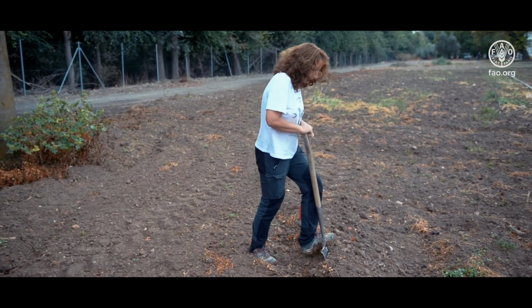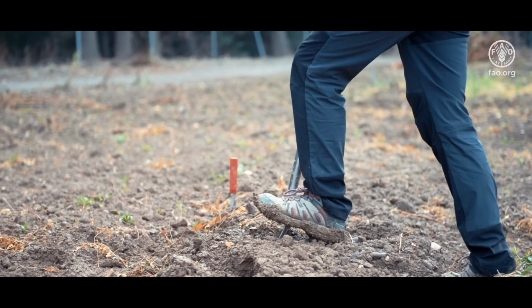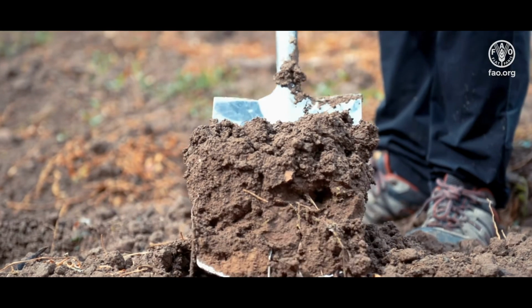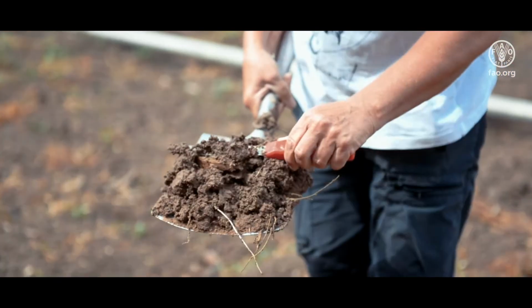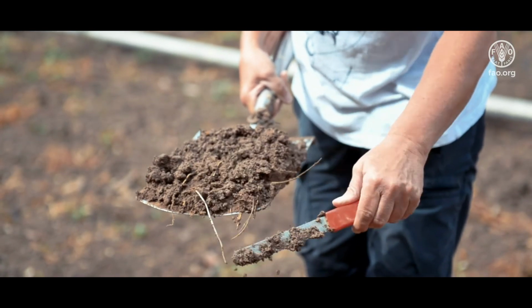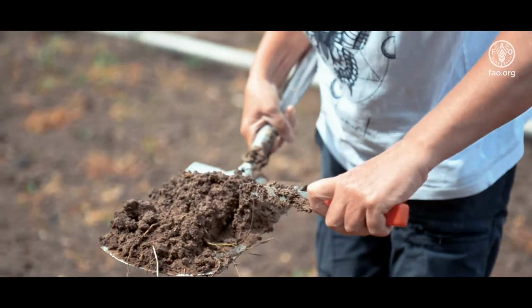To begin sampling, we should insert the shovel into the ground 20 centimeters deep, making a V-cut. Then we lift out the shovel full of soil. With a knife, a trowel, or even by hand, if the soil is soft, remove the top and both sides of the slice on the shovel, leaving a narrow central strip.